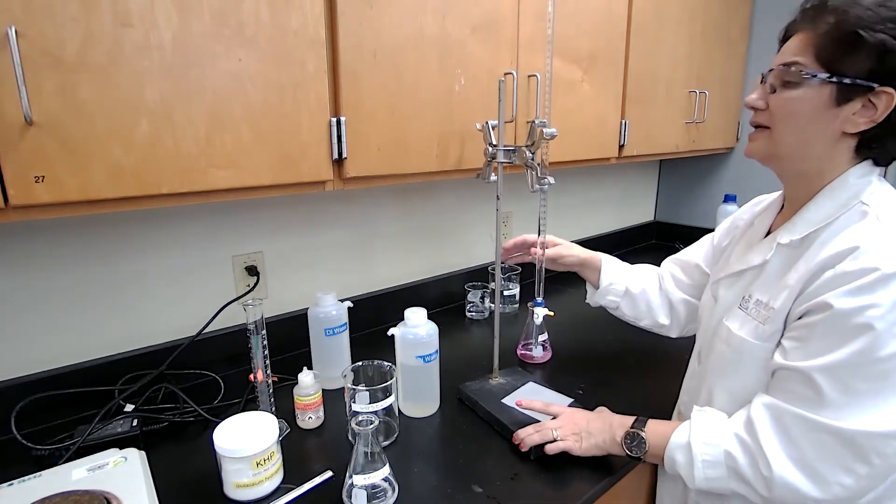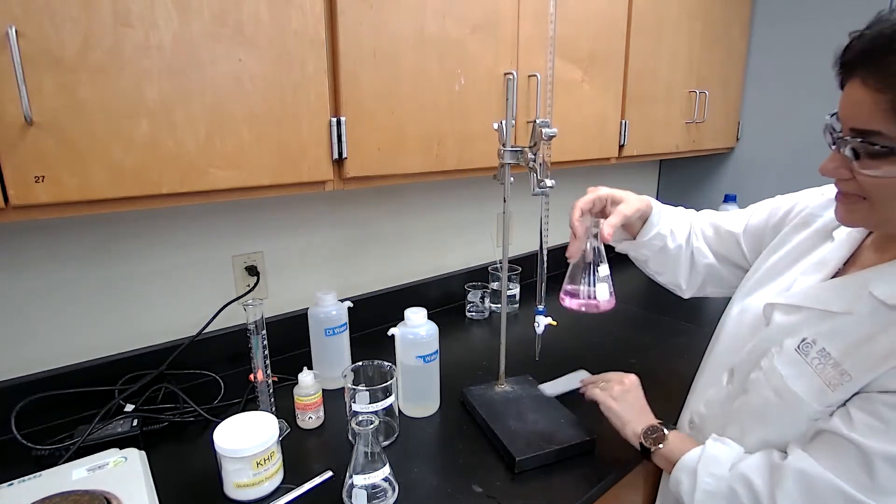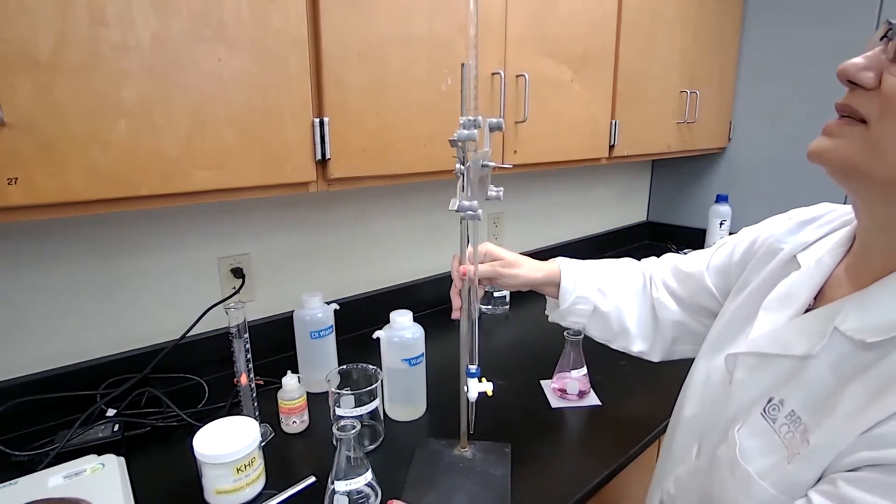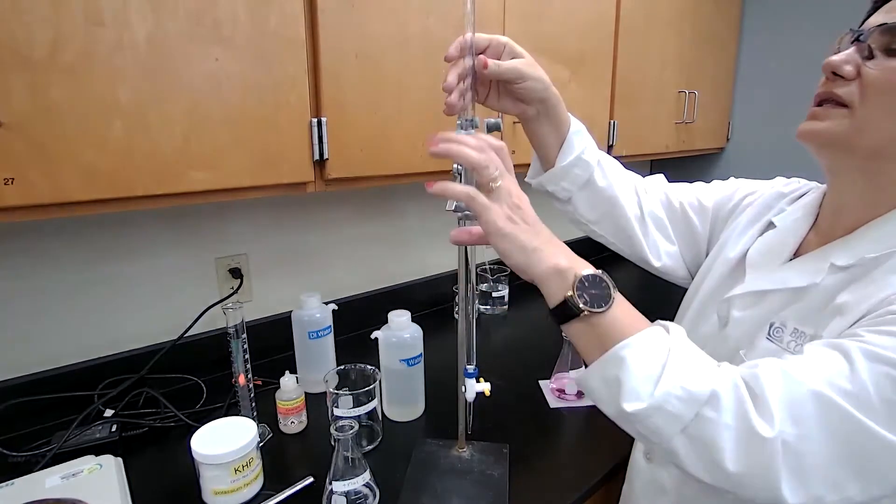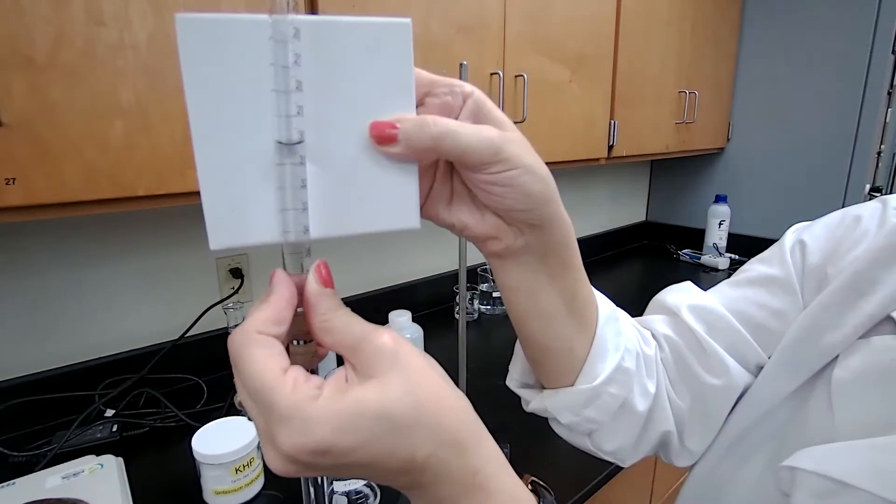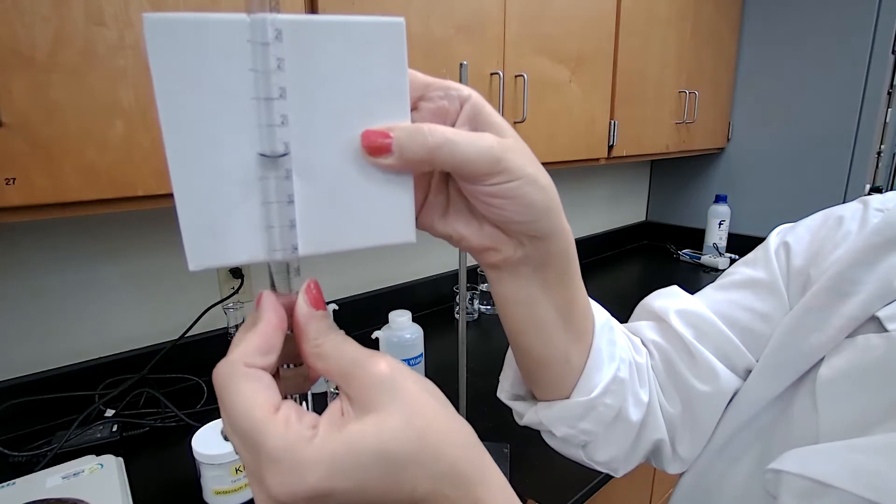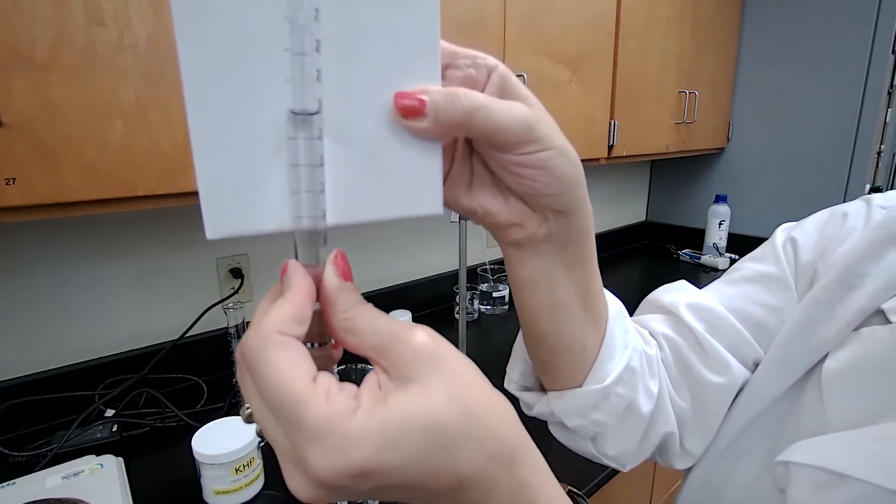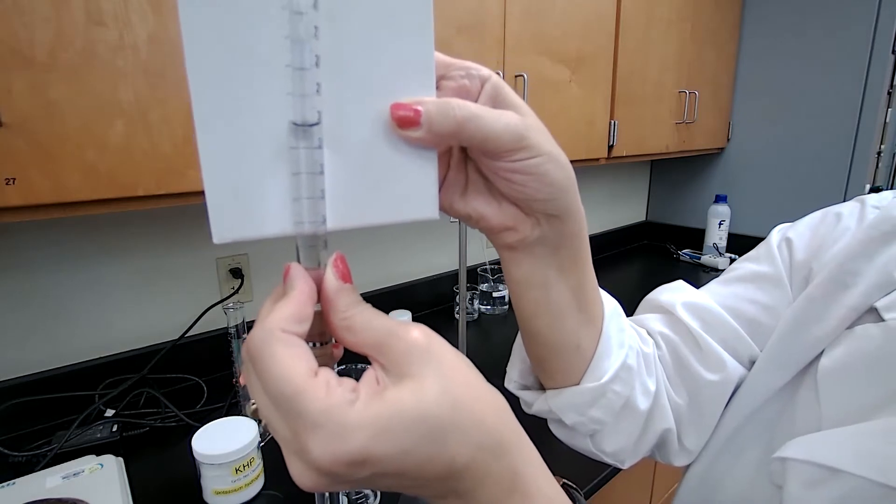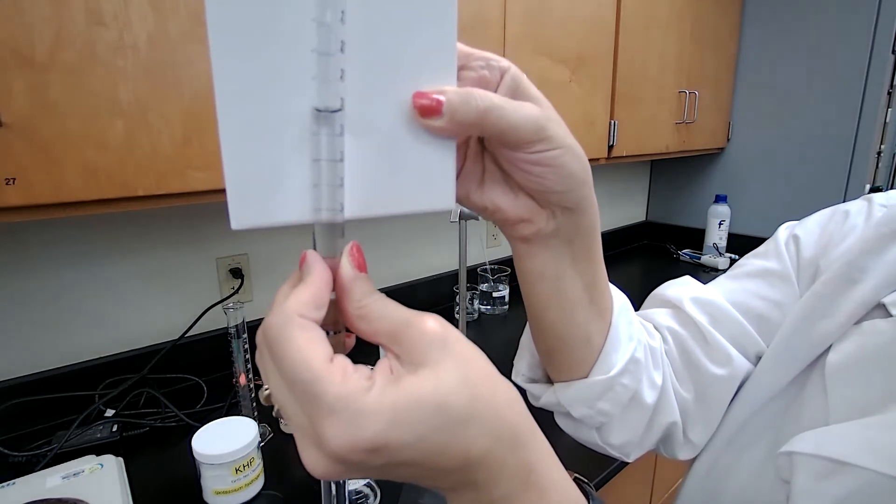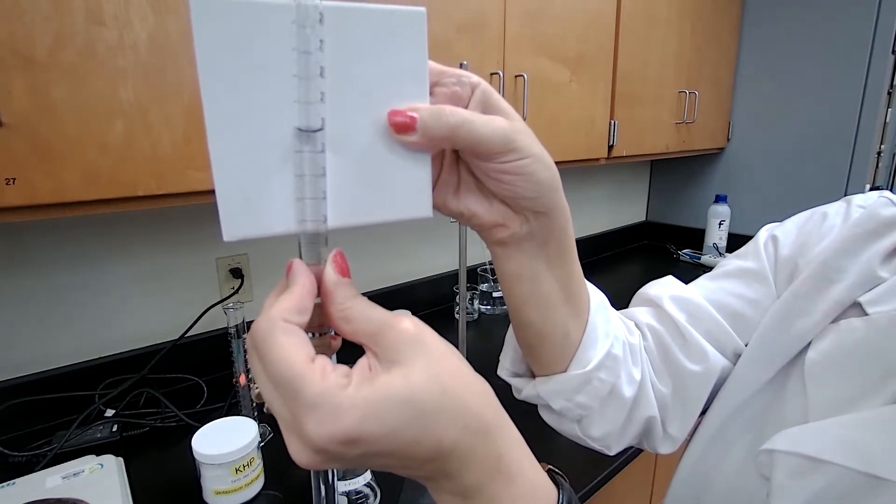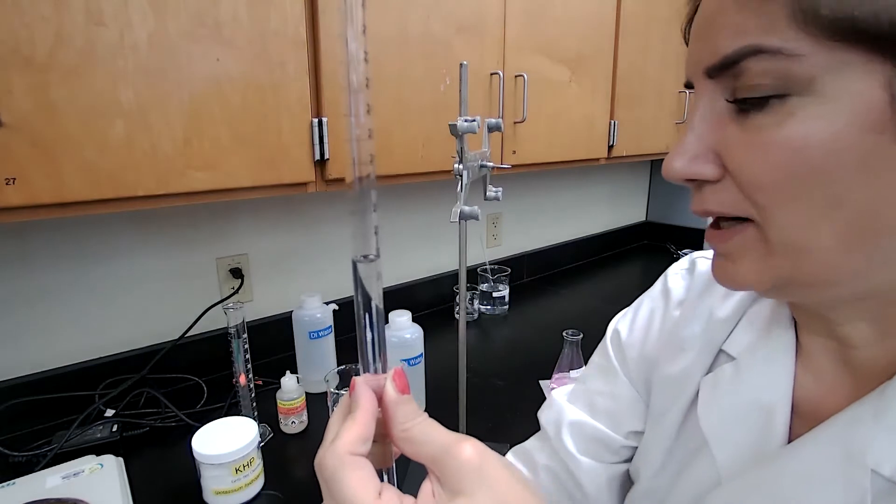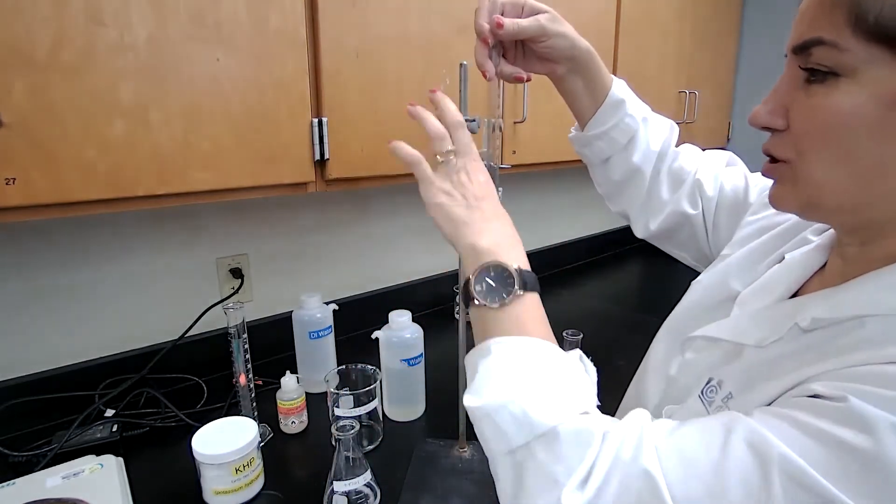The final burette reading—because this is stable now and it's light pink color—is between 30.2 and 30.3. You can estimate the second decimal place. So please record this as the final burette reading for trial one. And we are going to start with trial two.